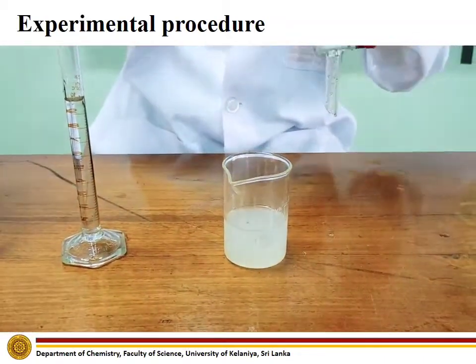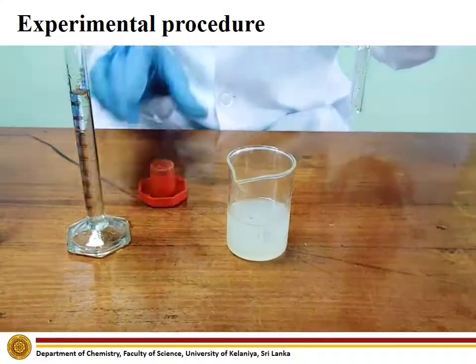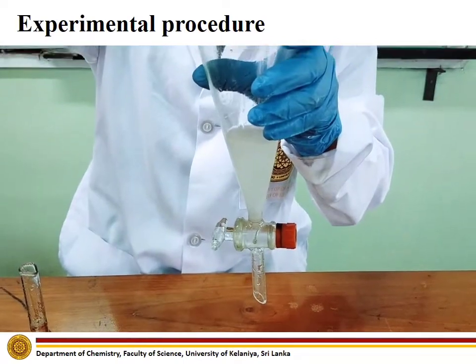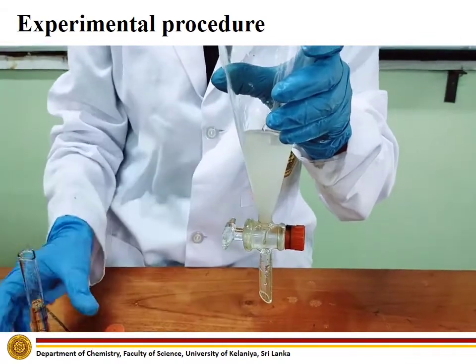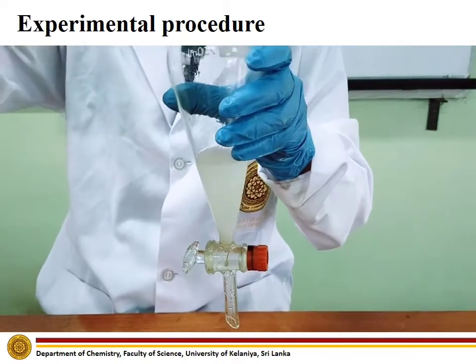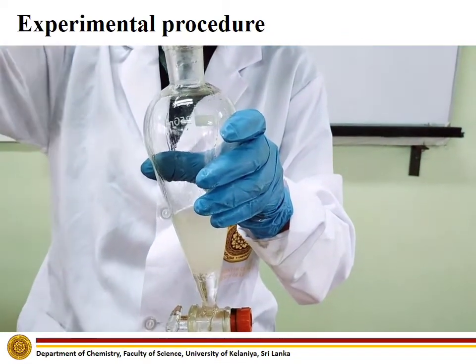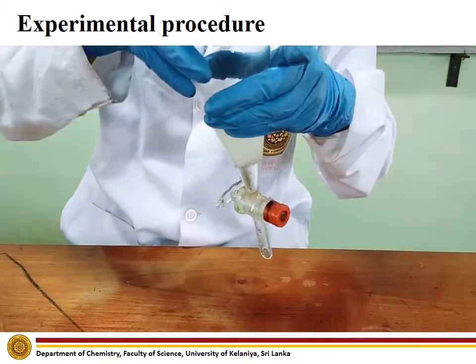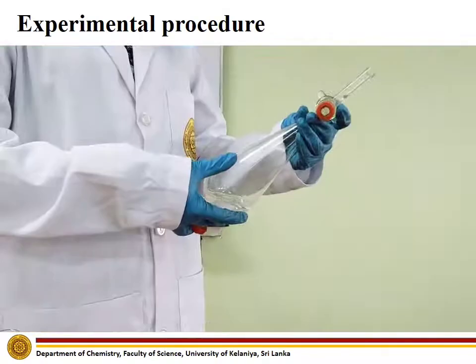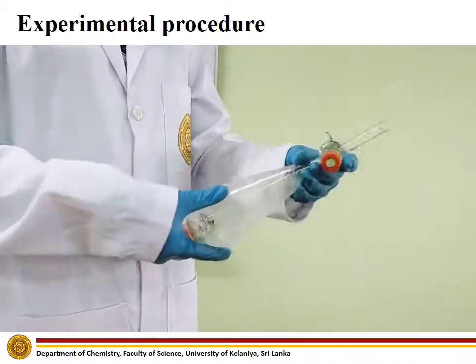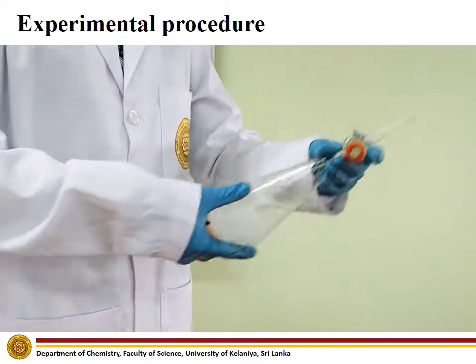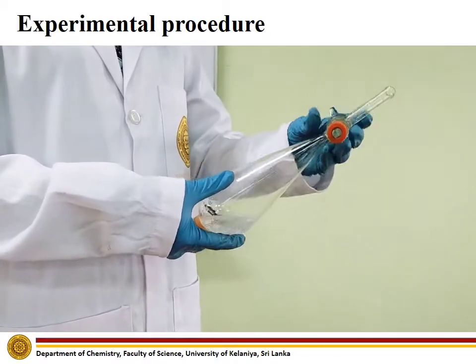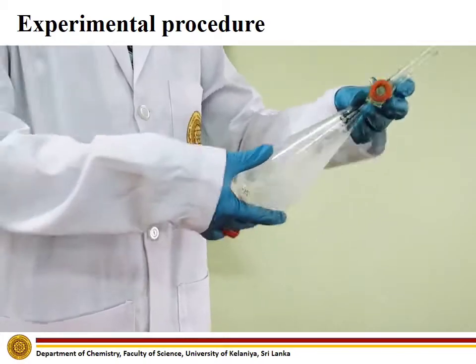Next, take a separating funnel and transfer all of the distillate into the separating funnel. Then add 10 ml of dichloromethane. Shake the contents of the separating funnel. While shaking, release the pressure that builds up in the separating funnel like this. Continue shaking for about 5 minutes.